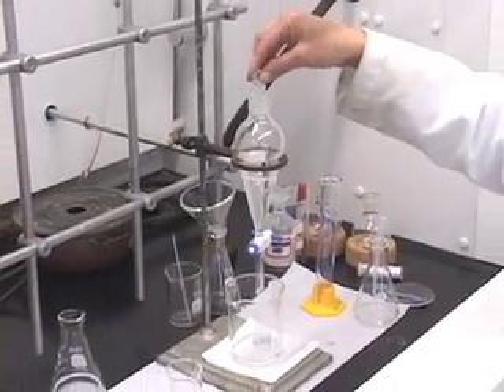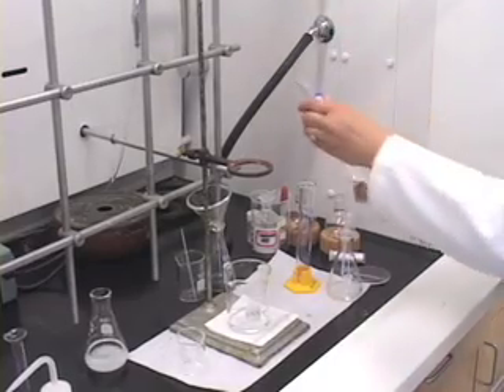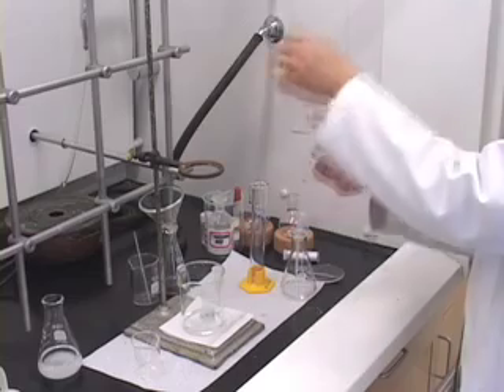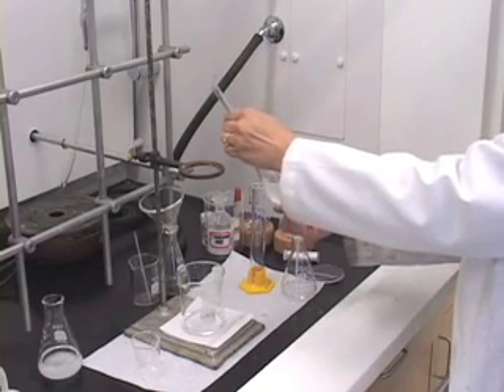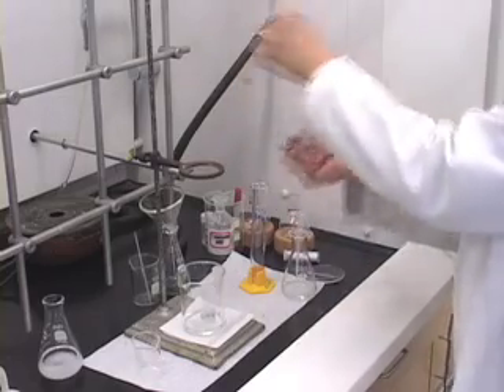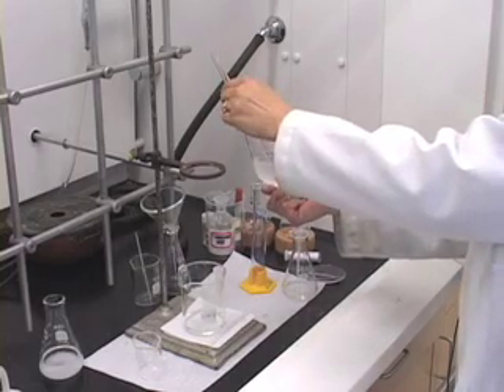So now we need to do the extraction as we did before. Invert it, open, shake a little, open, shake more, open.